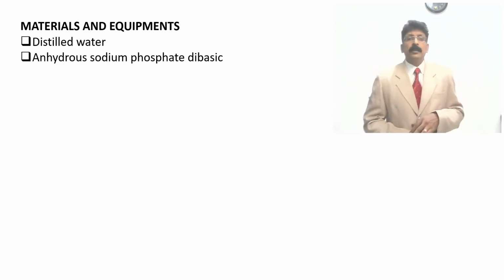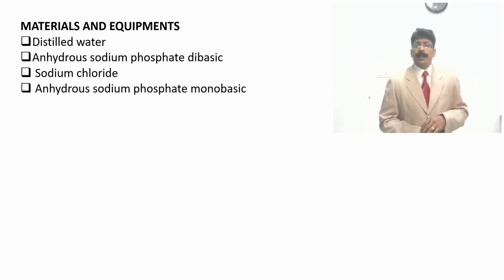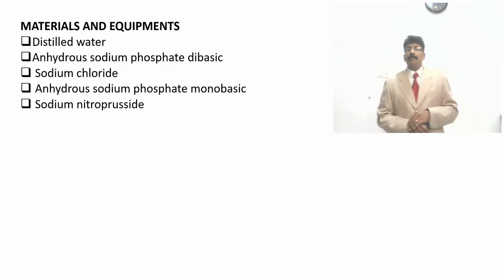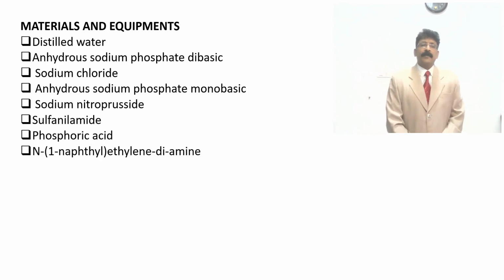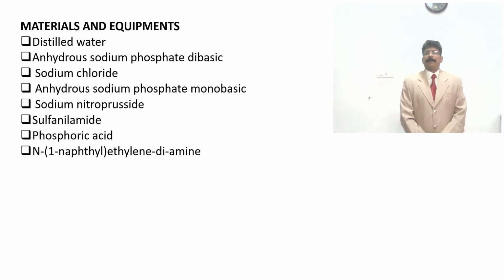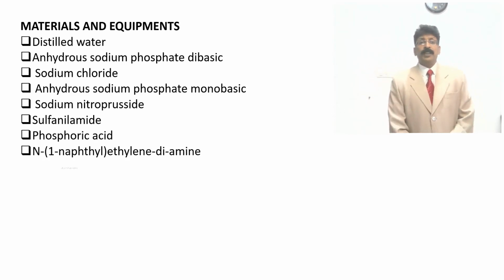The materials required are distilled water, anhydrous sodium phosphate dibasic, sodium chloride, anhydrous sodium phosphate monobasic, sodium nitroprusside, sulfanilamide, phosphoric acid, and N-1-naphthylethylenediamine. For the coupling reaction, we need the color formation for the determination.